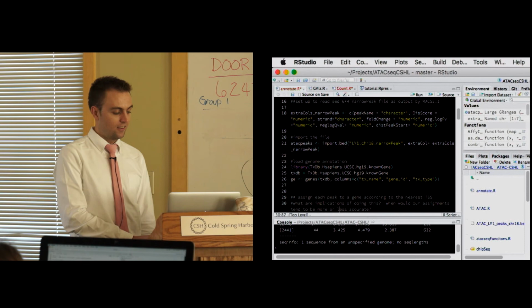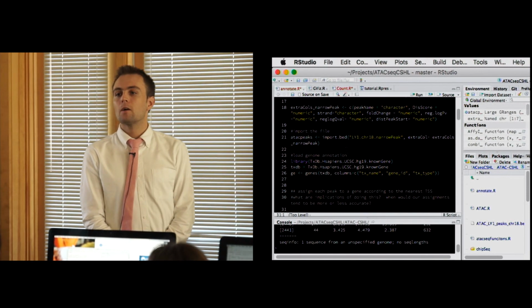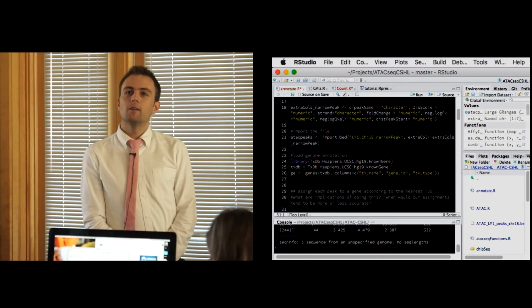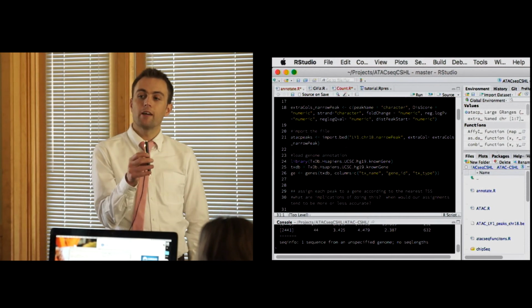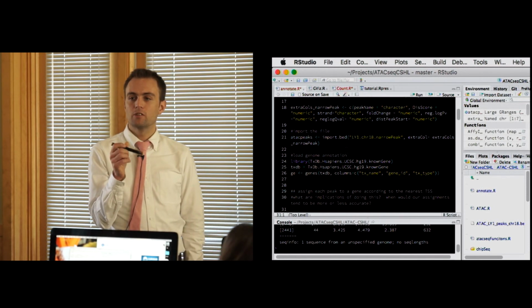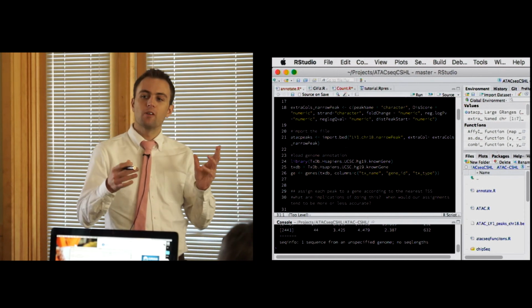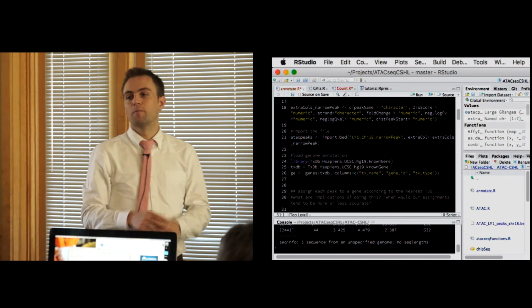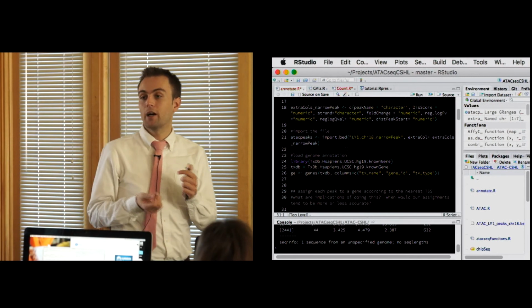Yeah, the negative log of the Q value. Mm-hmm. What kind of ranges are you considering? Yeah, Olivia mentioned it a little bit before. I've been using the p-value and then actually using IDR, which in a sense is similar to what the Q-value tries to get at, but with multiple samples, you rank where the p-values fall to set your threshold for where you want to set a cutoff for what you call a peak or not.